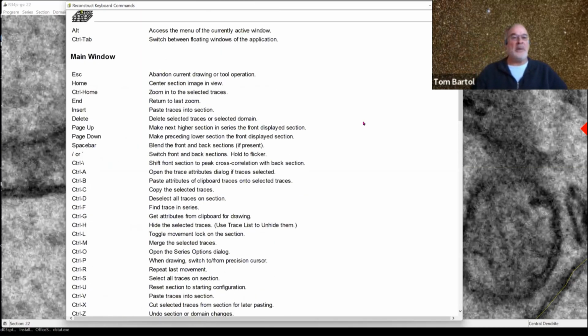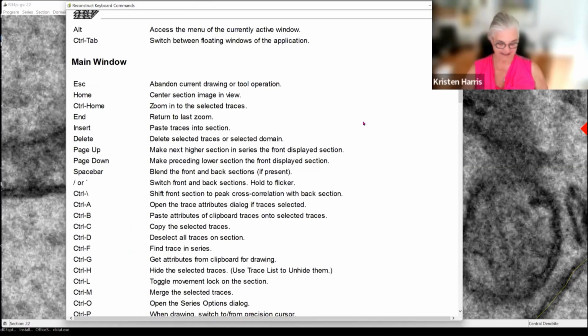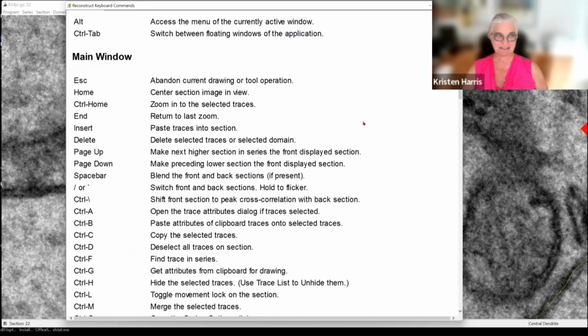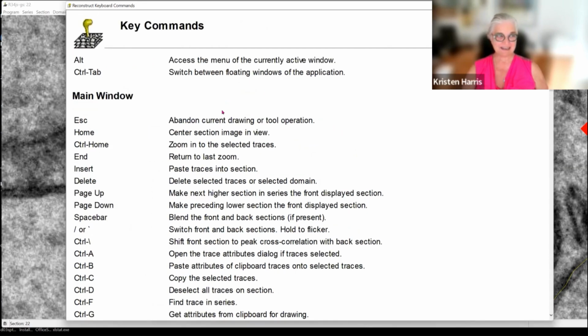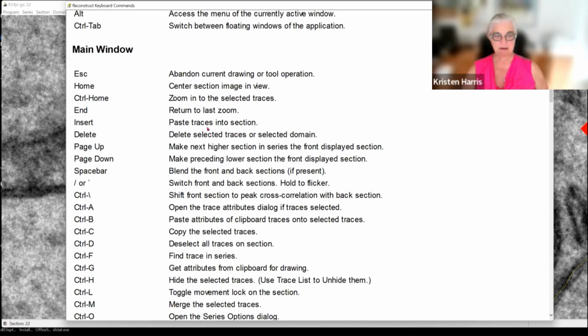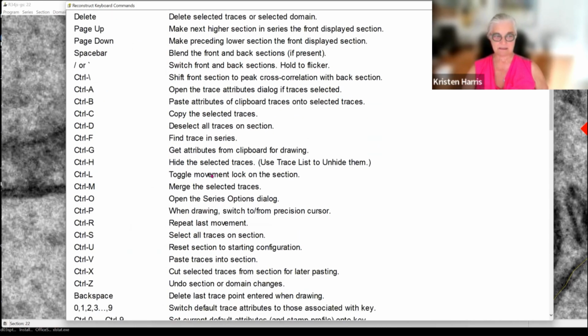All right. It's letting me do it. Okay, there you go. I wonder if I can always do that. I'm just using a control roller, just like you do, with Windows. So there we go. Sorry. So anyway, these are the main window ones. Just about all of them turn out to be useful. So why not use the exact same thing?